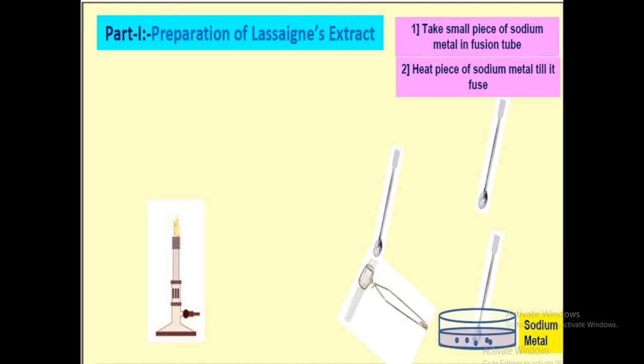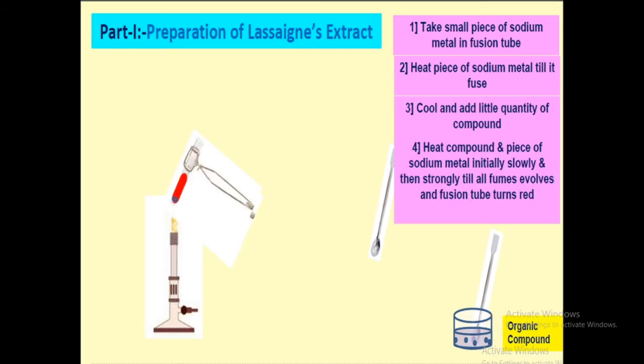Then we have to add a small amount of organic substance in it. Once we add the organic substance, then we have to place the mixture of organic substance and fused sodium metal under the flame.